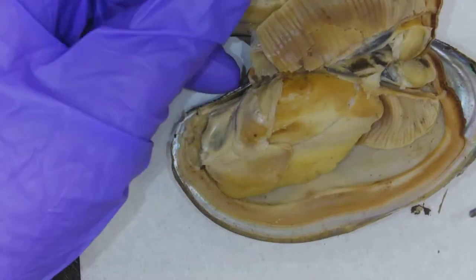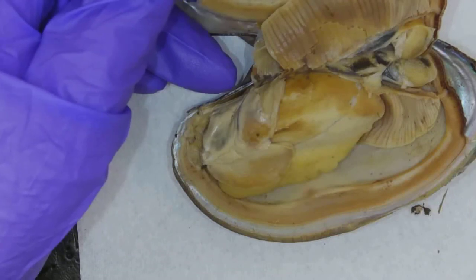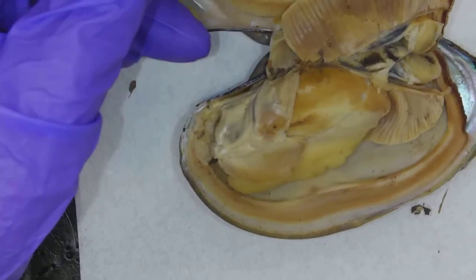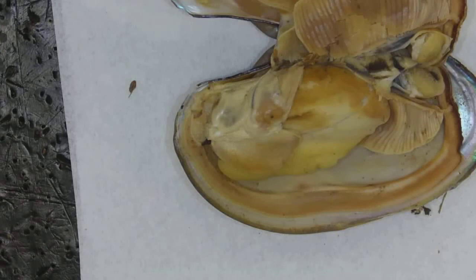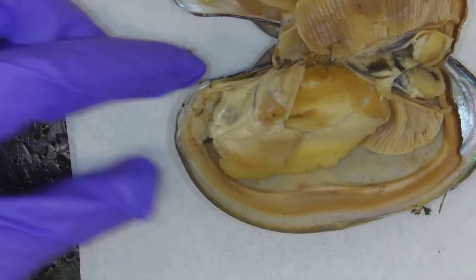I believe that has covered everything: mantle, gills, anus, intestine, gonads, digestive gland, mouth, those muscles. I believe that's everything. So I hope you've enjoyed the clam. When you eat a clam, what are you eating? You're eating everything — gonads, intestine, you name it. You usually don't eat the shell — you shell the clam, boil it, and gobble the whole thing down. So it's good to know what you eat.